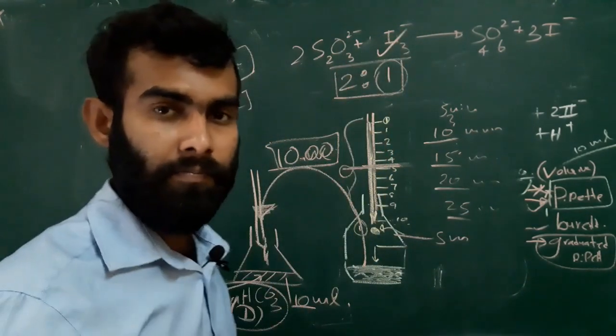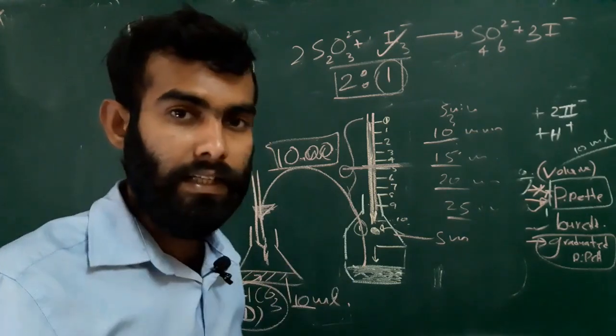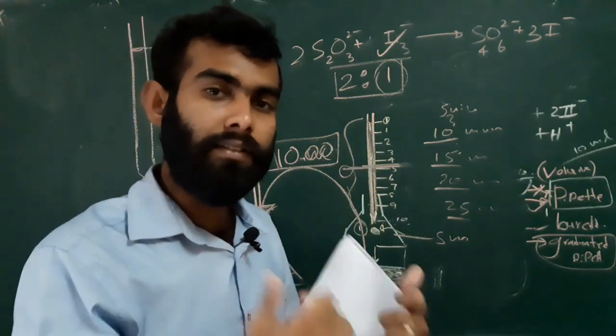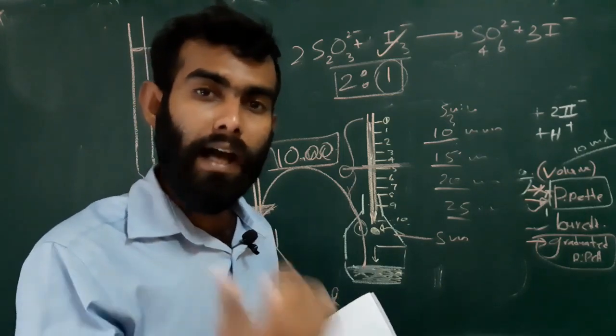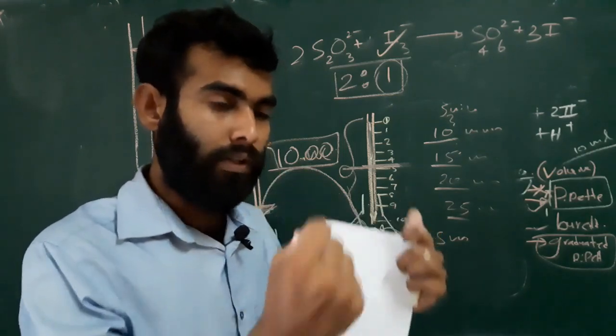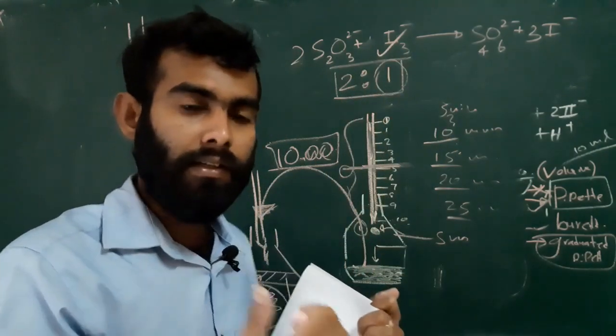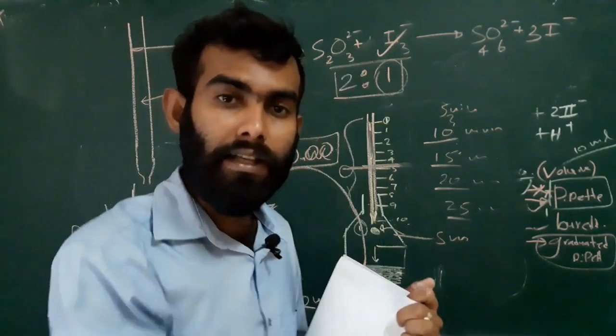What will happen? You know, initially at the beginning of this experiment, the iodine concentration will be very high because both reactants are in large amount. But with time, the reaction will happen and iodine will decrease.